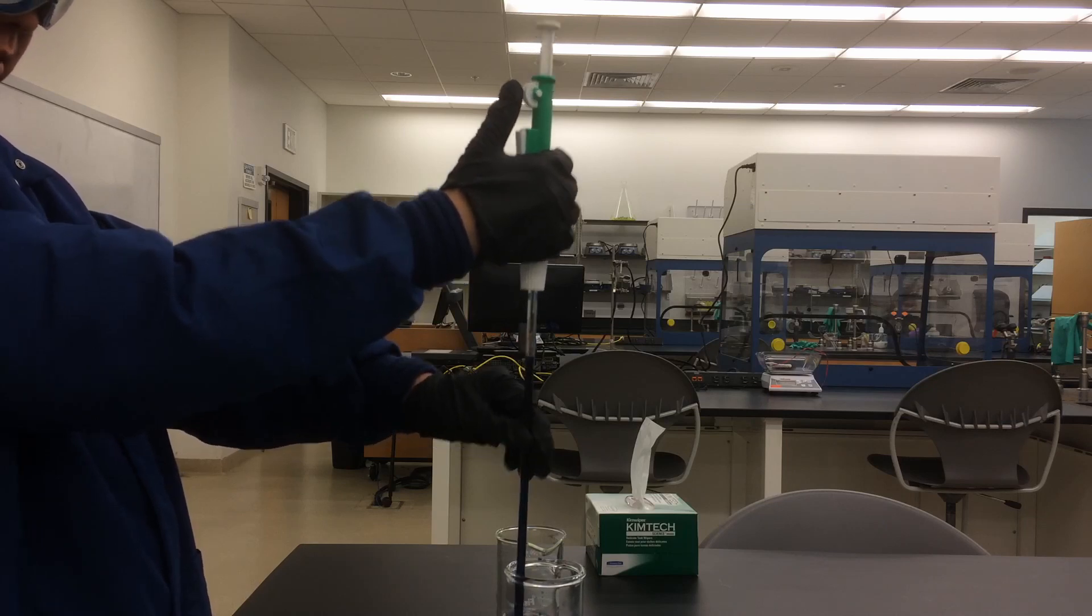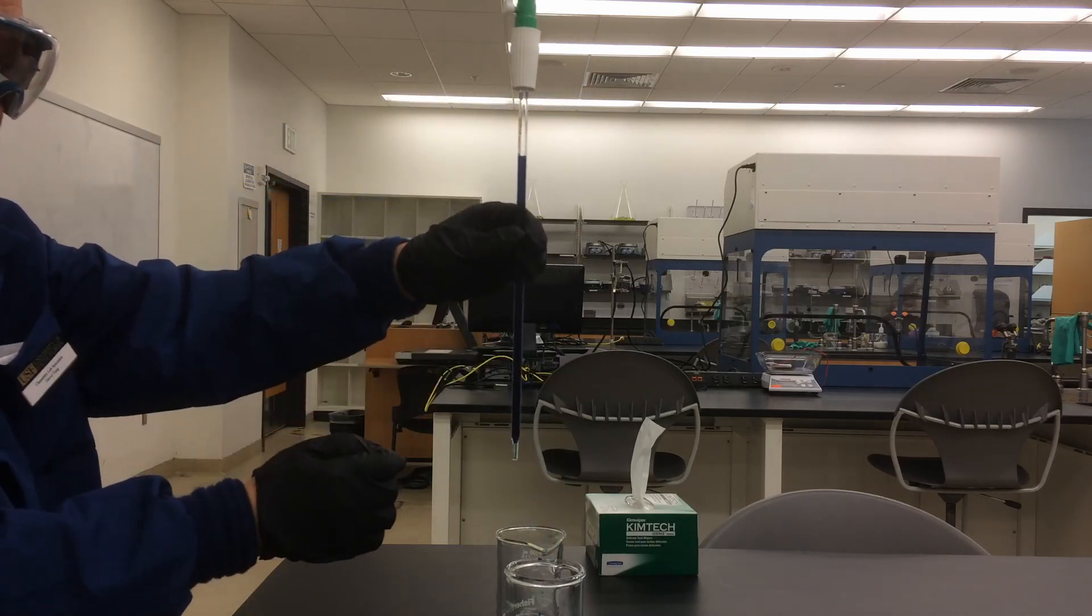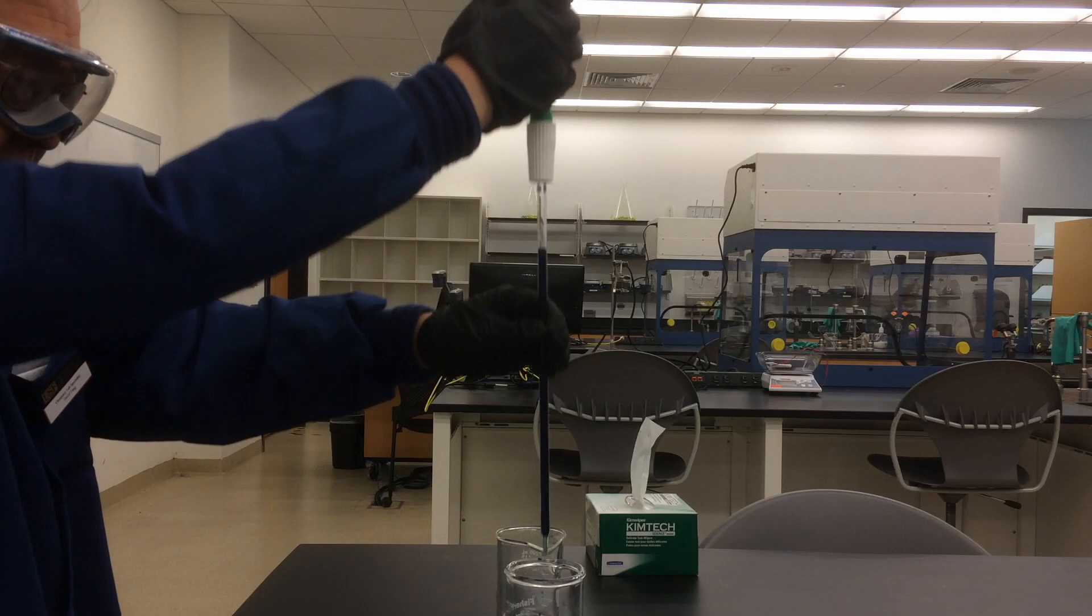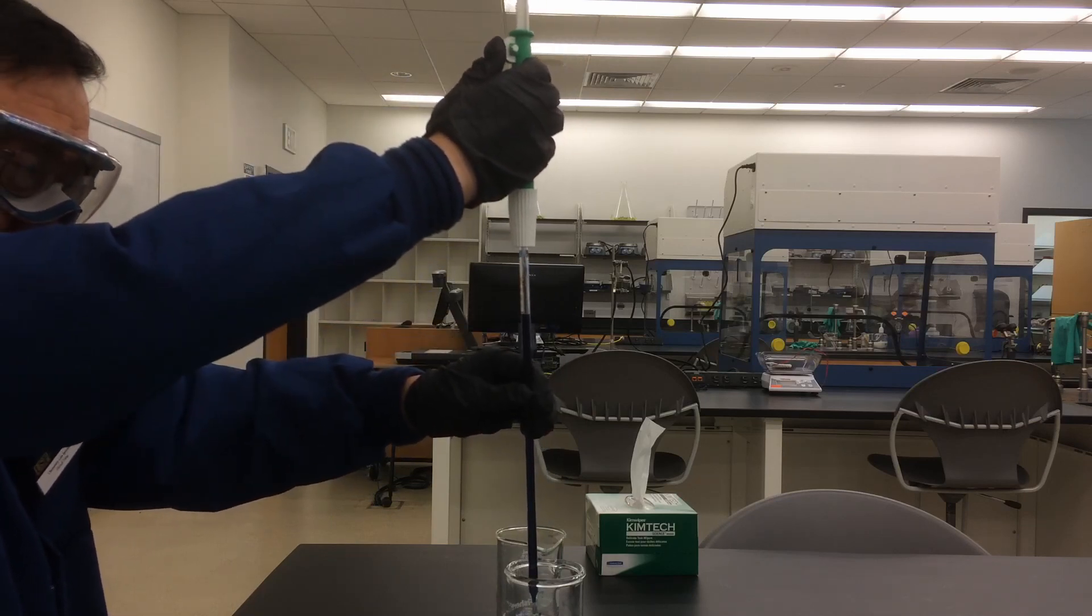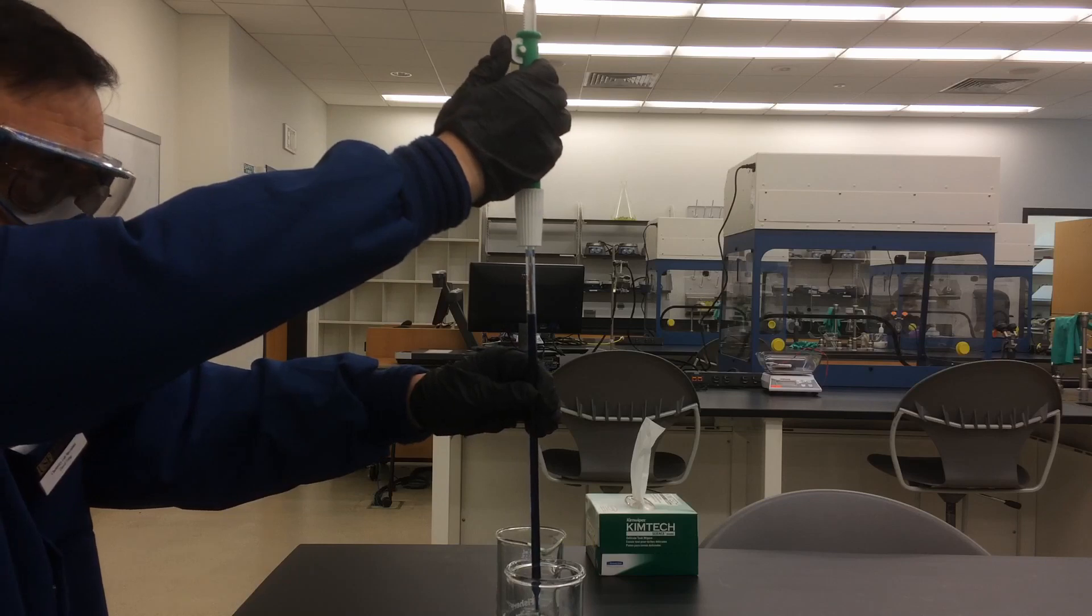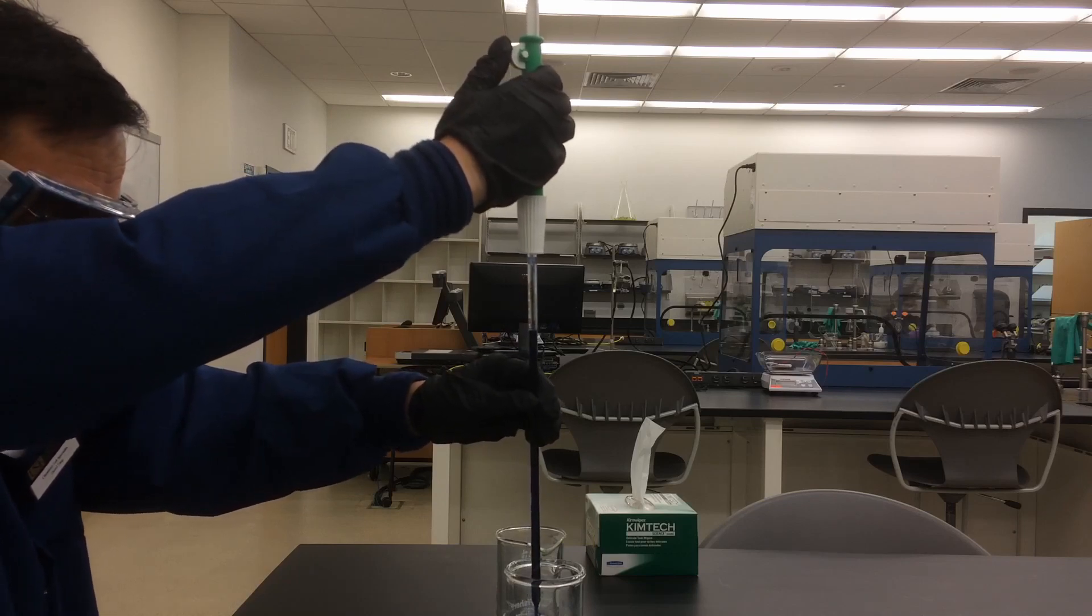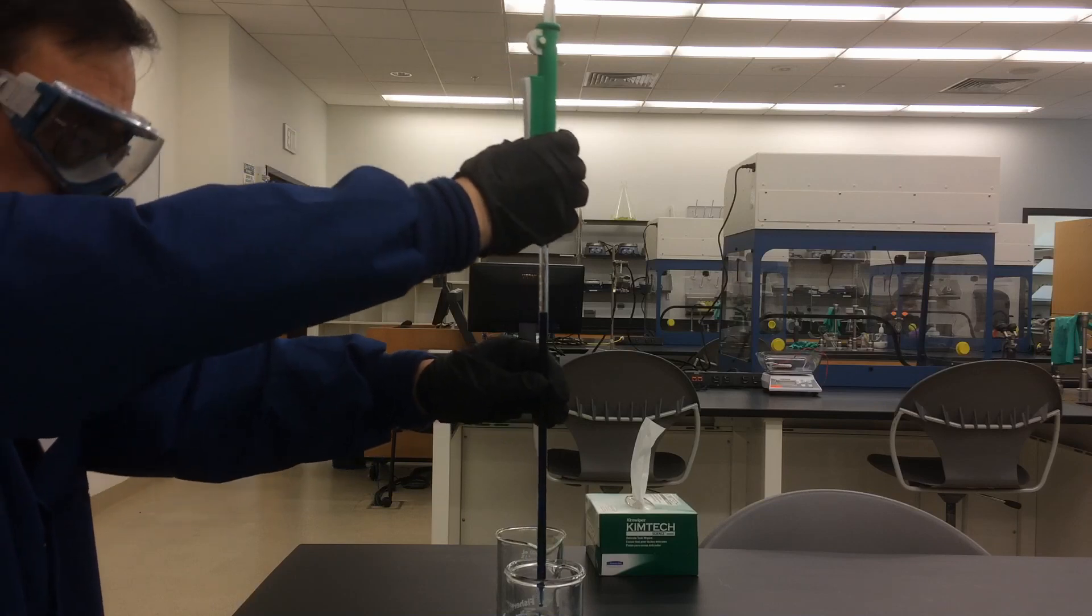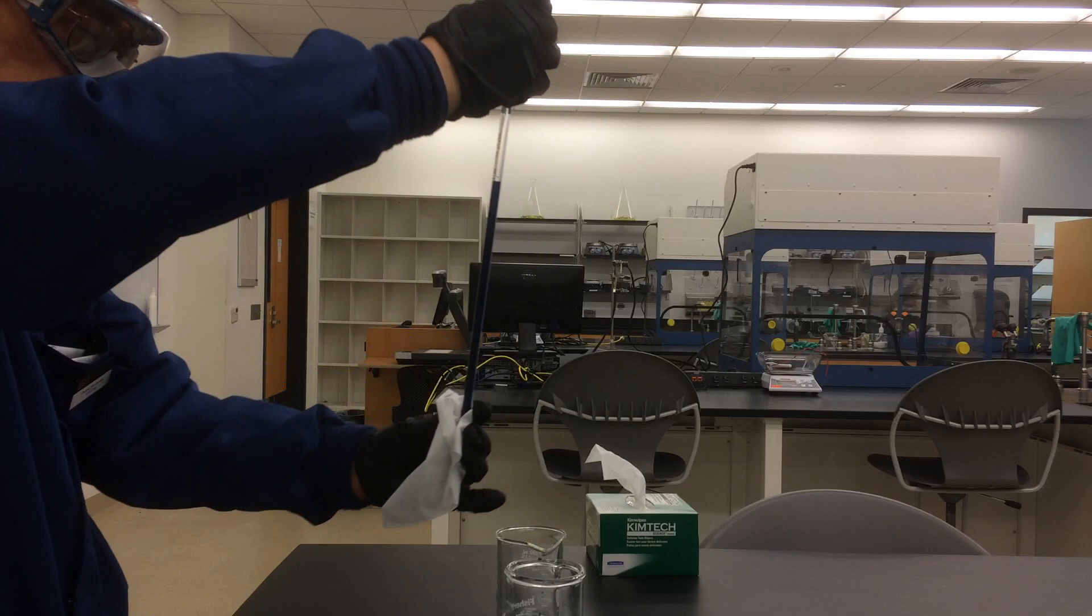With the zero mark at eye level, slowly roll up the wheel to drain the solution until the bottom of the meniscus is on top of the zero mark. And you can remove the pipette from the pump.